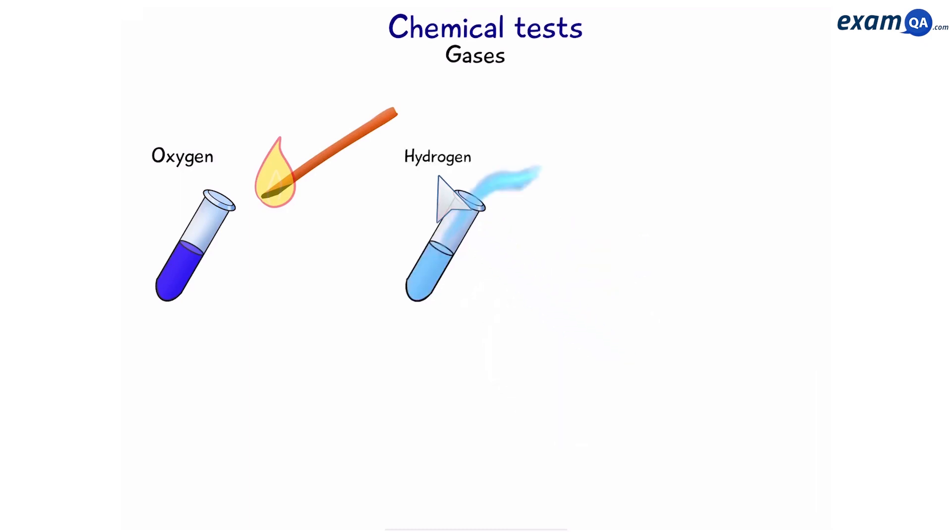Okay next, testing for hydrogen. We're going to take a splint that's on fire, place it over the gas and we should hear squeaky pop.